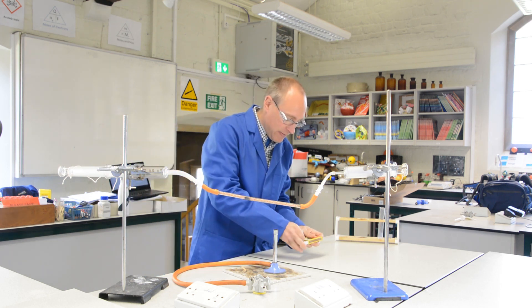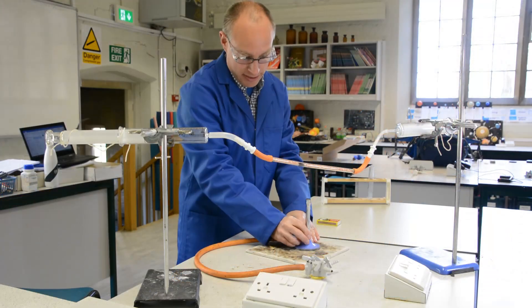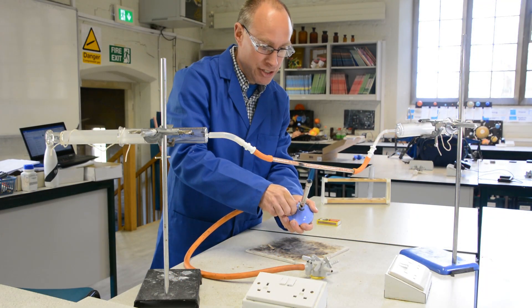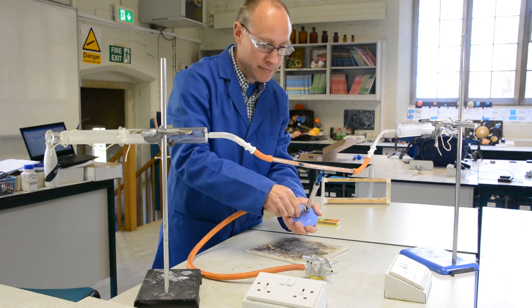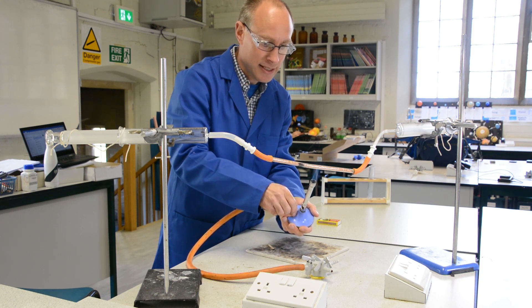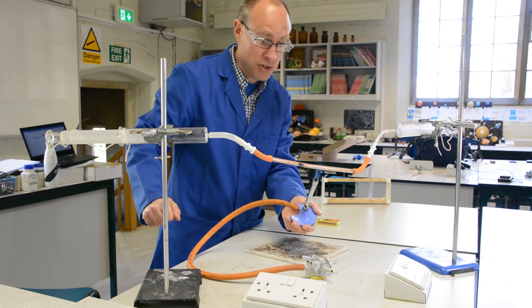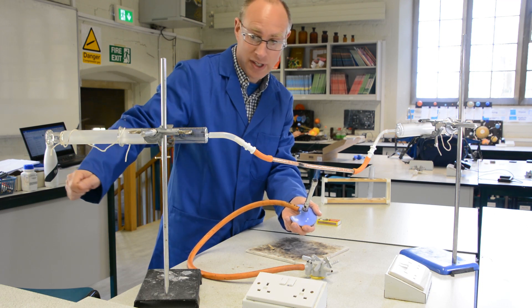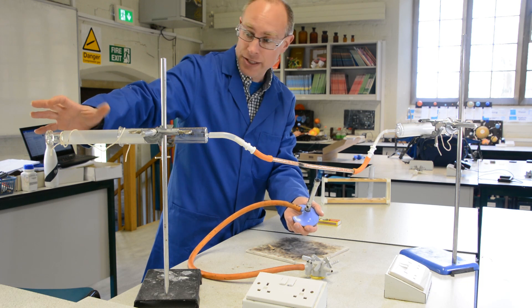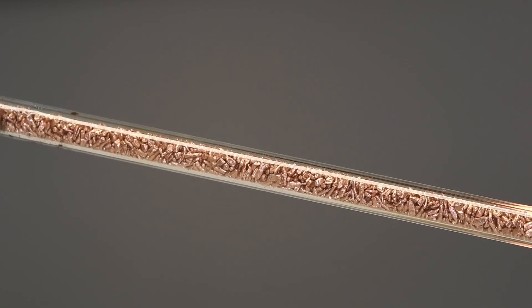Now, if I heat up the copper in that tube — I'm going to get that really good and hot. And once that's been heated up, and the copper is as hot as the Bunsen burner can get it, what I'll then do is start pushing the air across that copper. As the air goes through, the oxygen in the air will react with the copper and it will make copper oxide.